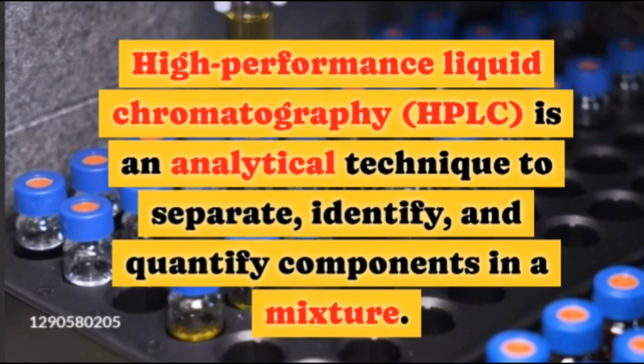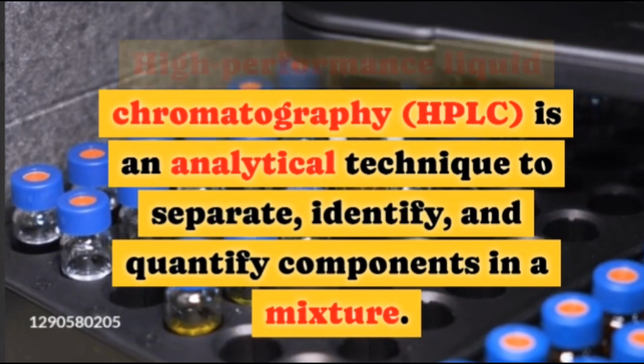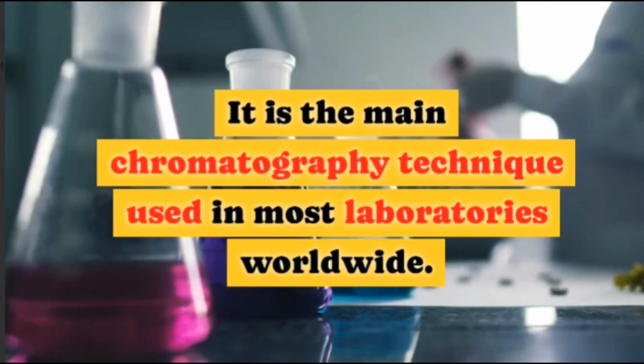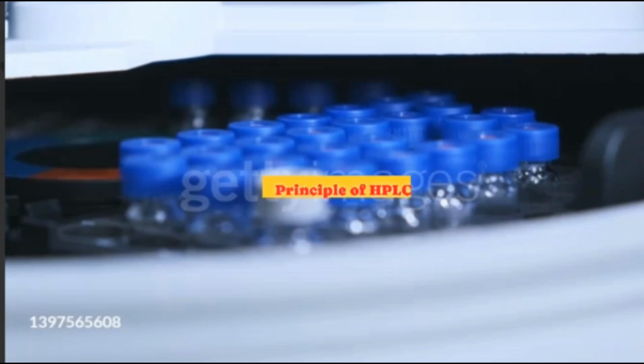High Performance Liquid Chromatography, HPLC, is an analytical technique to separate, identify, and quantify components in a mixture. It is the main chromatography technique used in most laboratories worldwide.